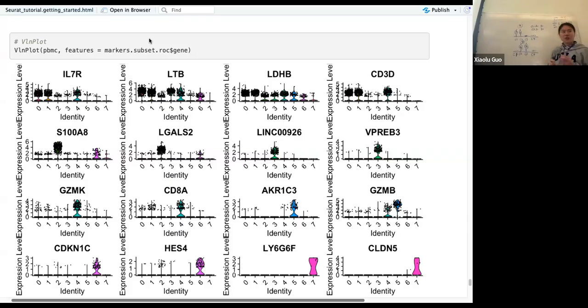And if it's A negative and B negative, what's that? C4, right, because it doesn't express anything. So actually, two markers can help you distinguish. In a perfect situation, it will help you distinguish all four clusters.